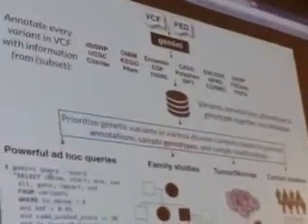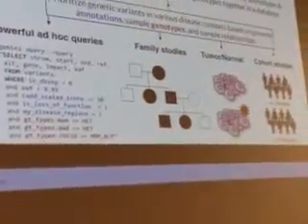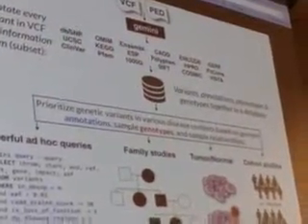Normal and doing cohort studies, trying to identify things. So as long as you can understand the SQL, MySQL type database, you can do a query on this at any time. I've exported it out, just a very simplistic version of it, and let me see if I can find it. Here we go. So this is from a particular patient from the AGHI, our Alabama Genomic Health Initiative that we've started up. And I'm just looking at one of my favorite genes. I'm trying to test a couple of pipelines for our new and upcoming AGHI group. And I was just pulling out my favorite gene out of Gemini after I annotated it.